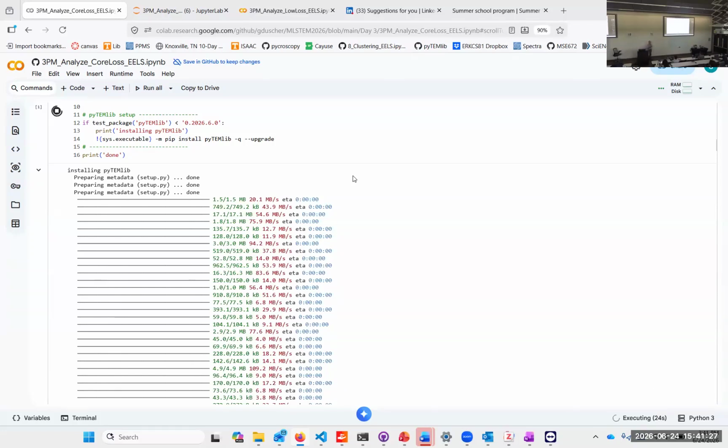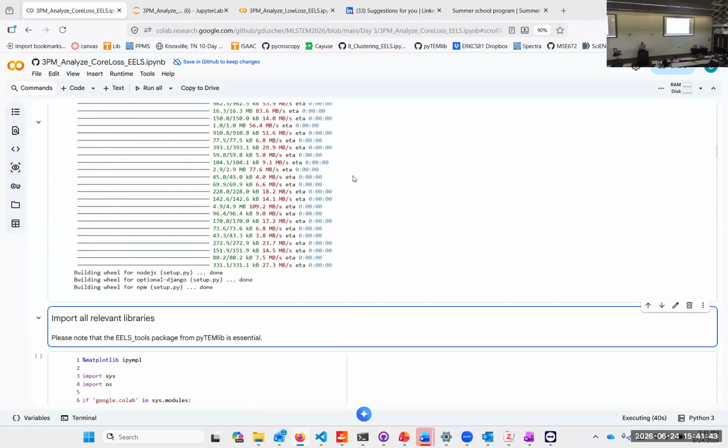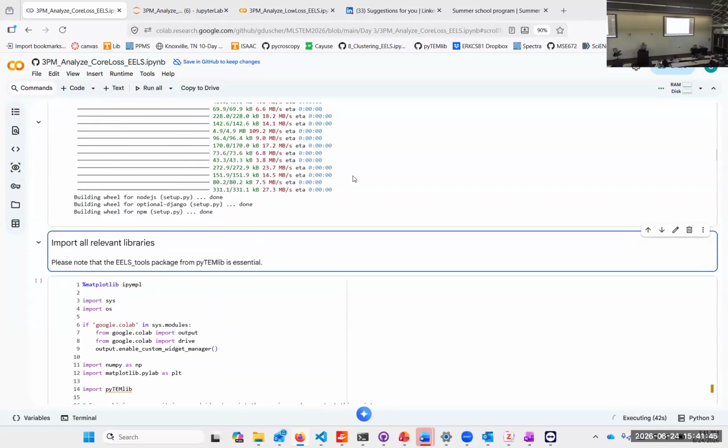And we have many of them. So we have O and N edges that are very, very close to the Fermi level, but they are still having, of course, an energy loss, and they will introduce a background before that.